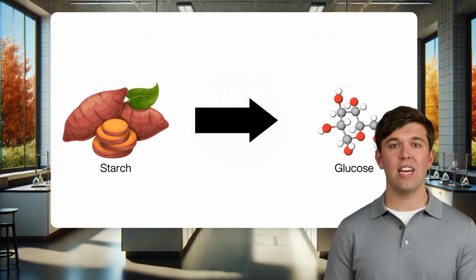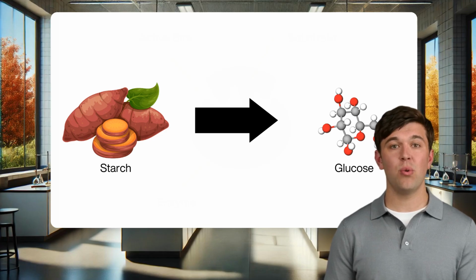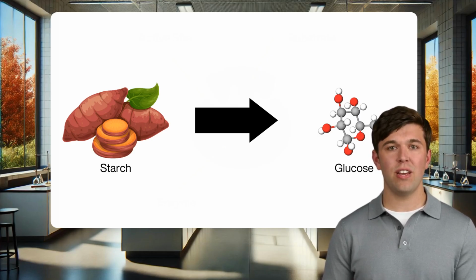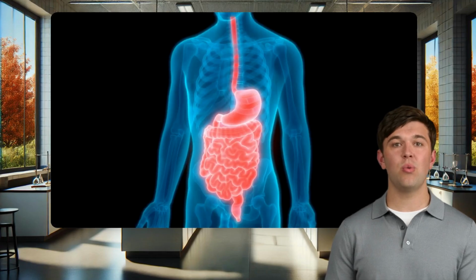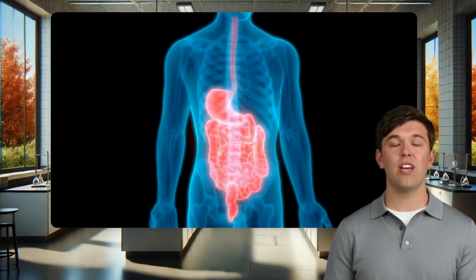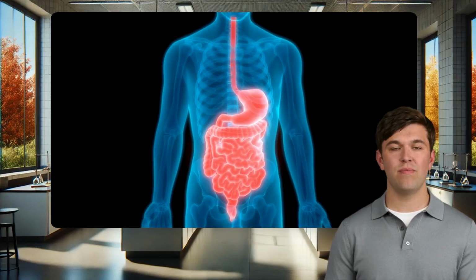We've covered that enzymes help to break down large insoluble molecules into smaller soluble ones that can be digested by the body's cells. Now, building on this foundation, we introduce our new practical where we will test for different biomolecules, specifically carbohydrates, lipids, and proteins using qualitative reagents. Testing for these biomolecules will help us grasp how enzymes work in breaking them down during digestion, and how we can detect their presence in different foods.